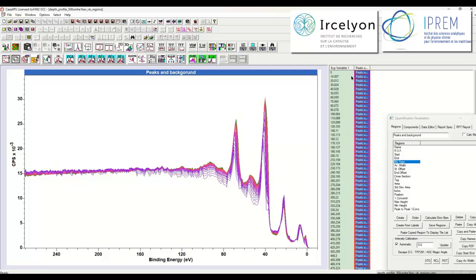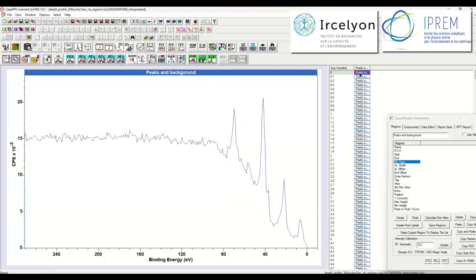And I can do this when I overlay the spectra in the active tile using the difference spectrum button, and that will allow me to make some adjustments to the data by subtracting one of the spectra from the other. The 2 spectra that were selected were the first and the last in the list that was displayed in the active tile. That is true when you use the difference button on the toolbar. That's not true if you use the difference button on the calculated dialog window, but on the toolbar it allows a range to be displayed in the active tile, and it will pick the first and the last as that range to perform the difference calculation.